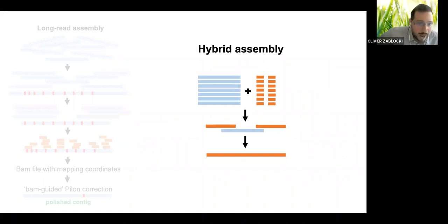And briefly, the hybrid assembly, although we'll get back to that a bit later, is essentially within SPAdes. It does not perform the assembly with both read types together. It performs the SPAdes assembly as usual, graph-based with short reads, and then attempts to resolve gaps using long reads to scaffold the contigs into final products. So it is not used during the actual assembly process, but rather to polish whatever gap there may be.